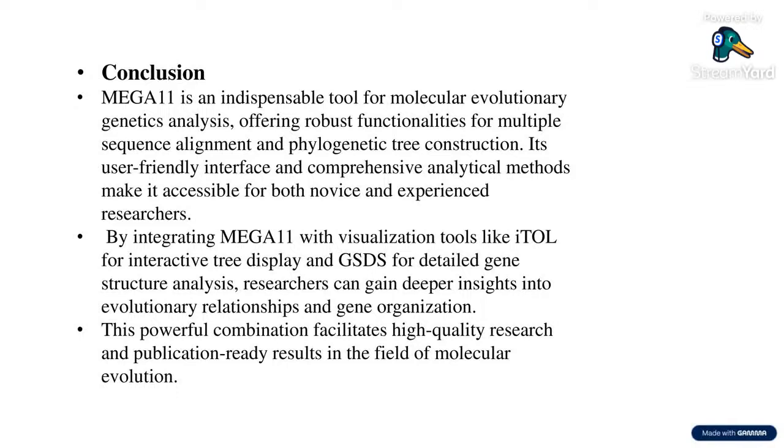And if we talk about GSDS advantages, it is helpful for visualizing gene models clearly, including exons, introns, UTRs, and for cross-species comparison. It is also great for isoform and alternative splicing analysis. But the main limitation is that with a FASTA file, the FASTA header must first be removed. There is no sequence analysis, alignment, or evaluation. That is also a limitation of GSDS, and it cannot process large genomes or large genomic data.